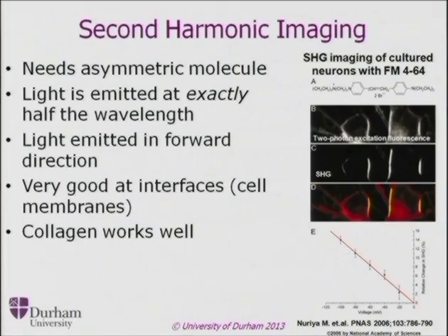It's very good. The light is only emitted, or primarily emitted, in the forward direction. So it doesn't come out in all directions, so that could be a problem. It's also very good. I said it has to be an asymmetrically shaped molecule.